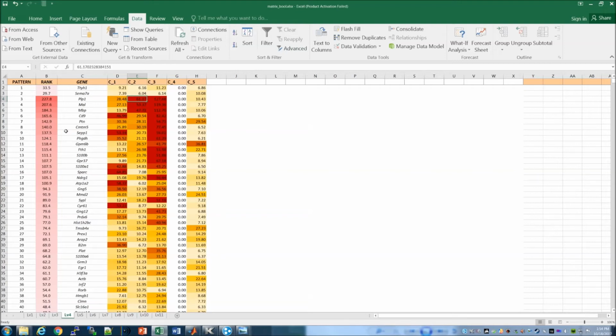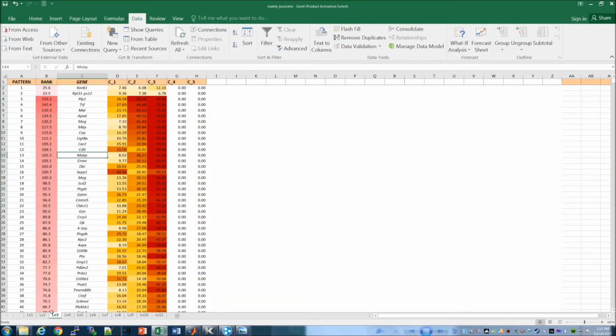cluster. So one thing you need to know is that there are 2 ways to sort these markers, a pattern and a rank way. By default you will have all sorted by pattern, which means you can see more clearly here from level 3, that the pattern groups together the markers expressed in the same cluster.